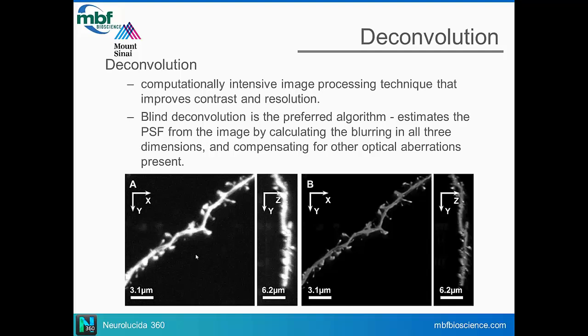But deconvolution is a great tool to help to create that digital image in as clear a focus as possible that represents the way that the tissue was in its original state. And so you're trying to identify the point of origin for each of these photons and then remove any extraneous noise that is a consequence of the tissue around it, the mounting media, the cover glass, and all of the other factors that you're trying to subtract away using these mathematical models.